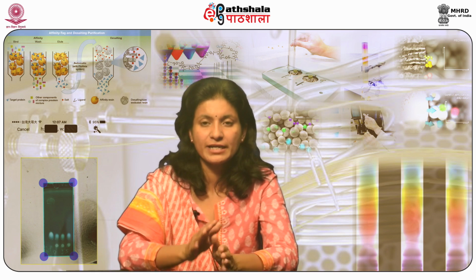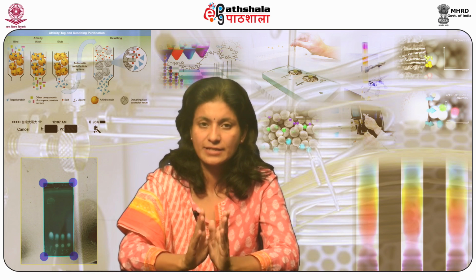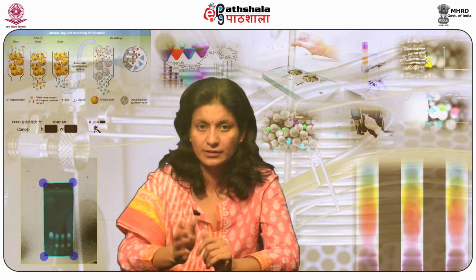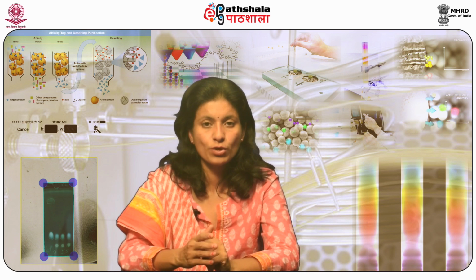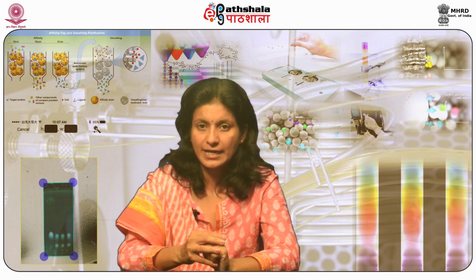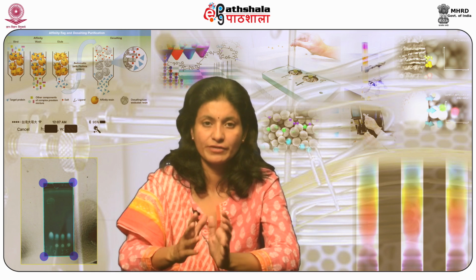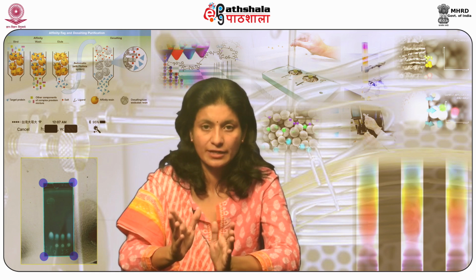Some of the significant examples of ion exchange chromatography in industrial aspects are the evaluation of coolant ionic constituents, for example, sodium hydroxide, ammonium ion, nitrite ion, calcium ion, sulfate ion, etc. Fatty acid investigation and trace sulfate evaluations in brines.